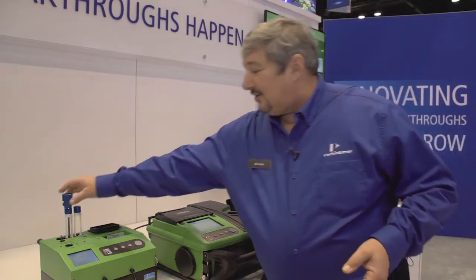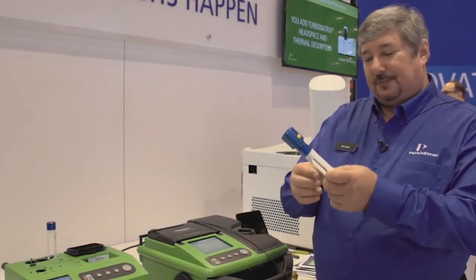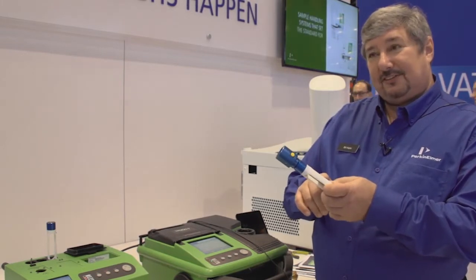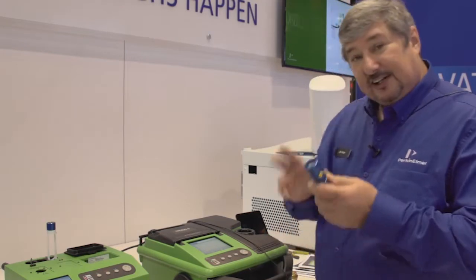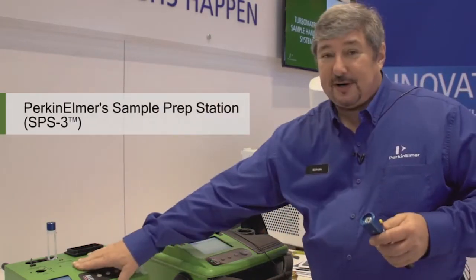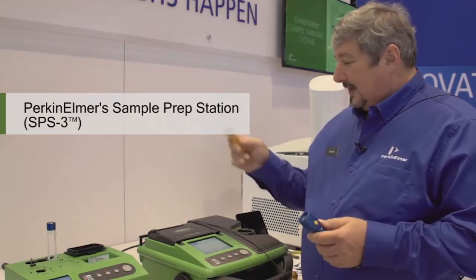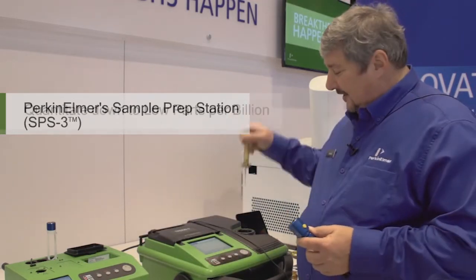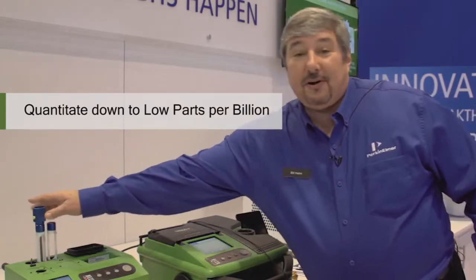I can use regular thermal desorption tubes so that I can put one of our pumps to this and pull through even a hundred liters of air. Then I can desorb this using our sample prep station onto the needle trap, add internal standard, and then inject on here, and I can quantitate down to low parts per billion.